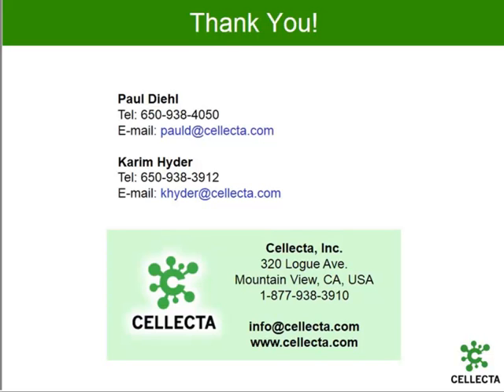And so it's going to take a little bit more studies to show whether there's an advantage to one over the other for certain types of genes or certain classes of genes, or maybe more readily identifiable, or certain hits are more useful for therapeutic applications, for example, with one screen versus another. But I think at this point, it's interesting to look at the results of both, and you then have 2 different approaches that are giving you essential genes, and that you can be more confident then in the results of the screens by comparing the results of the two different approaches.